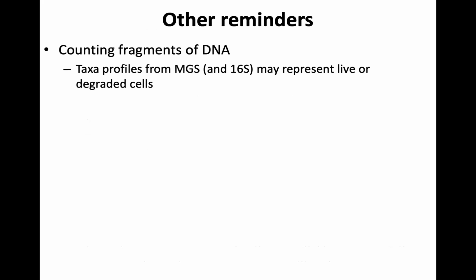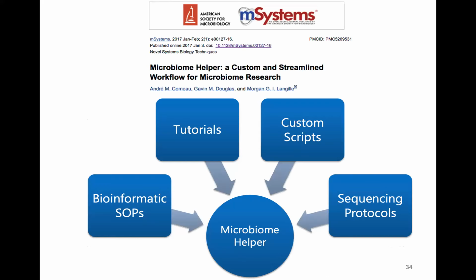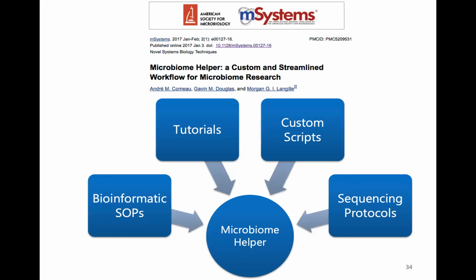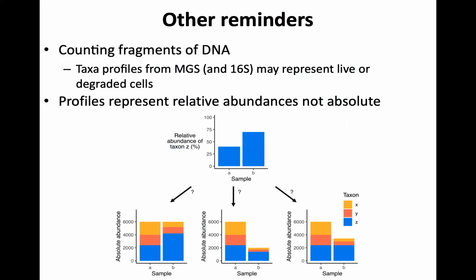Okay, and so with that, what is this? I will save this for later so we don't get behind, because this is just another reminder. I can talk about this after, and I will talk about, no, I'll just talk about it right now. Let's get over it. It won't take very long. So this is just a quick reminder. I like to remind people that when we're counting these things, we're talking about relative abundance and not absolute abundance, right? So it just means we have to take into account the different proportions of taxa.